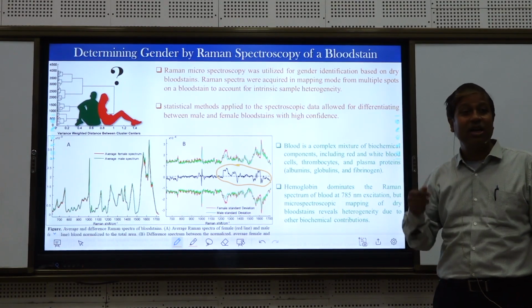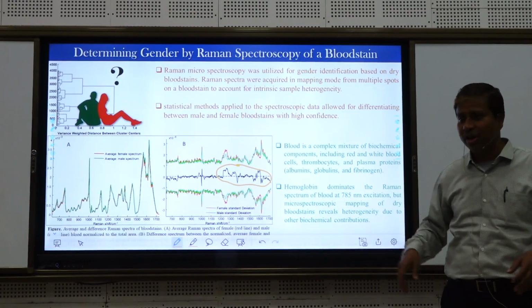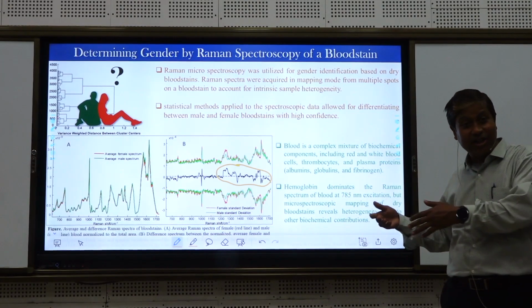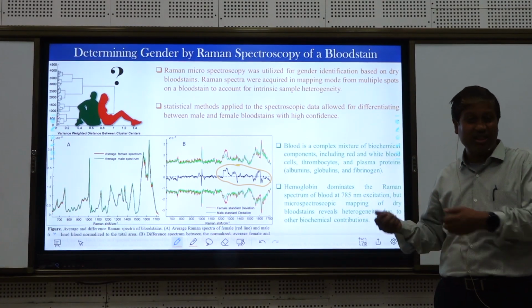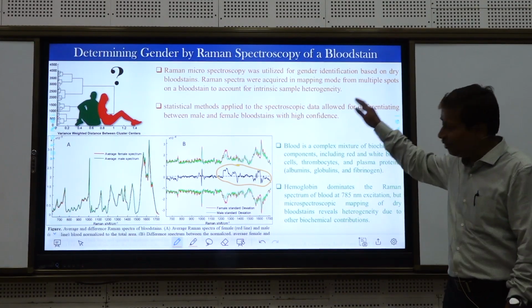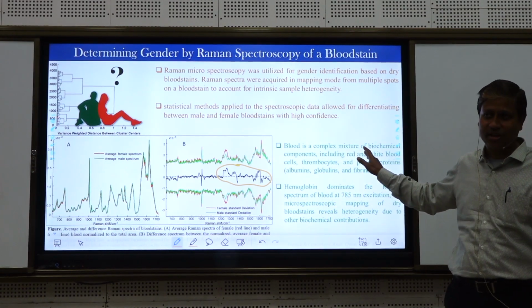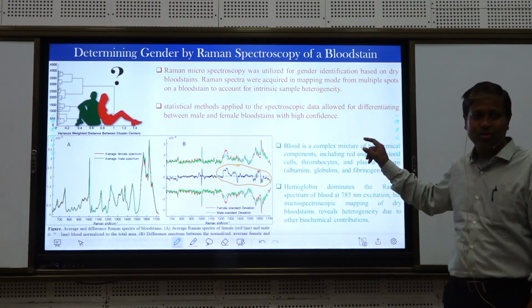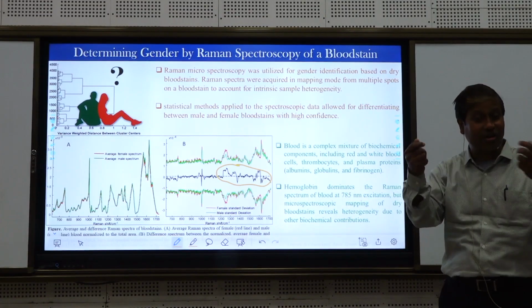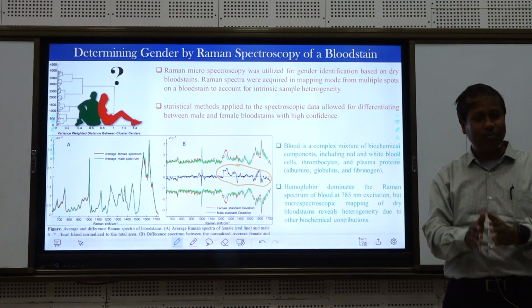If it is human blood, then whether it is peripheral blood, which means blood circulating in the body, or some menstrual blood, or animal blood, or synthetic blood. So you will see that so many kinds of studies are there, and for each and every study they have done lots of statistical analysis, lots, because at the end of the study, you have to tell the government that your report is a convincing one.